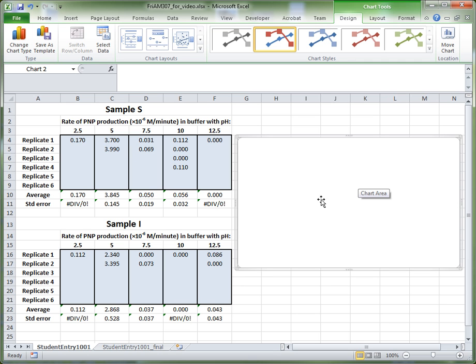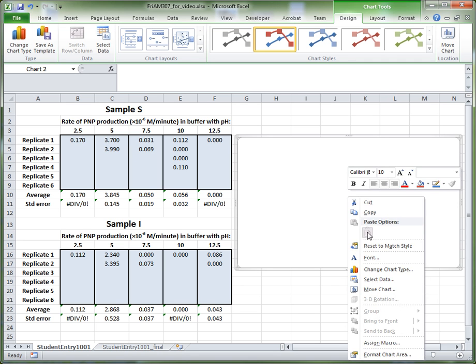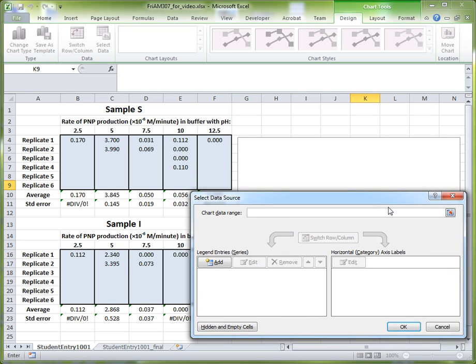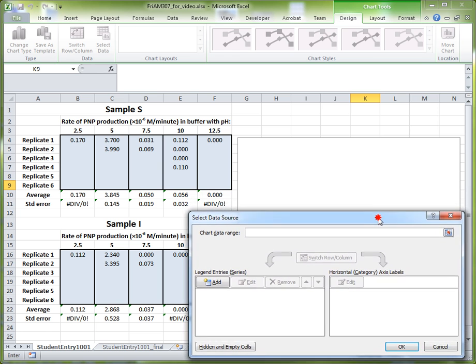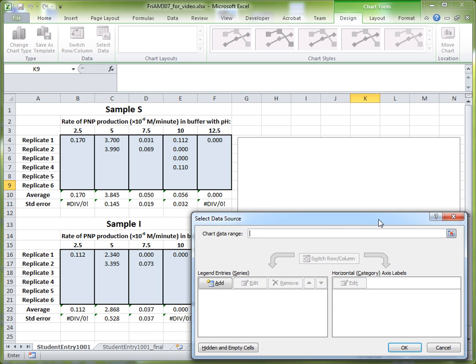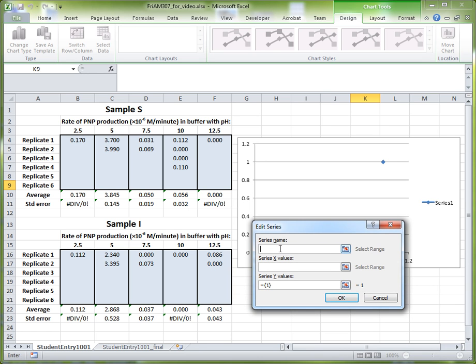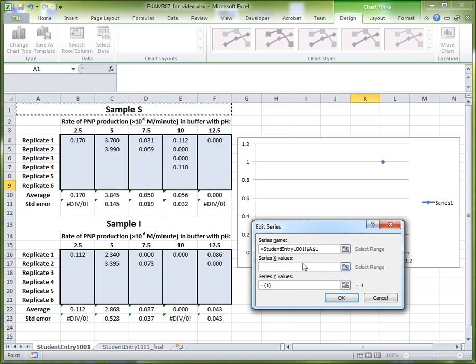To do that, right-click on this blank chart area, and then go down and click Select Data. This will open up a dialog which allows you to tell Excel exactly what to plot onto your graph. We want to add two series — a series is just a line in this particular type of graph. The first series we want to add is for sample S. To add a series, click Add, and then give it a name. You can either type in Sample S or click into the series name box and click on the corresponding cell in your worksheet, and that will automatically populate the series name.